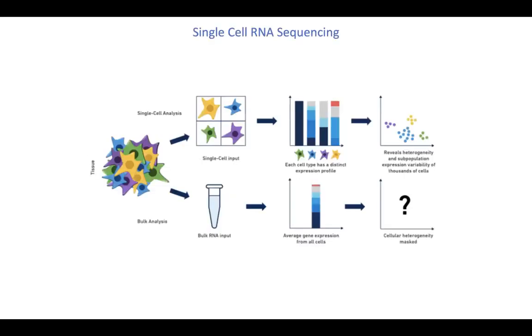Single-cell RNA sequencing is a method of determining the RNA expression profile for individual cells. This is useful for answering a number of biological questions. For example, single-cell RNA sequencing is used to classify cell types in mixed populations of cells and can uncover rare or previously uncategorized cell types whose signal would otherwise be overwhelmed in a heterogeneous cell population.